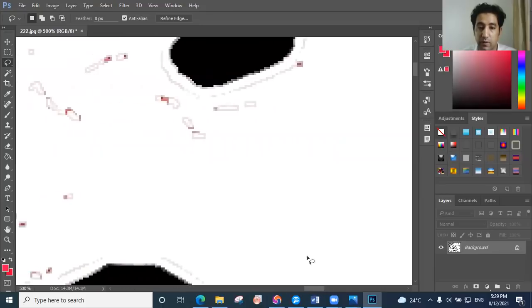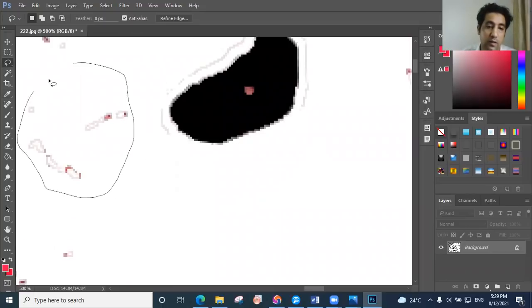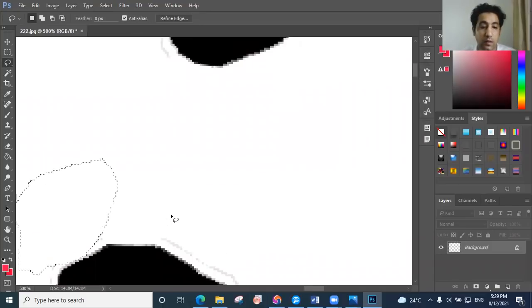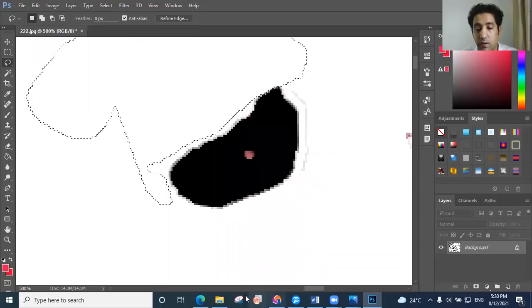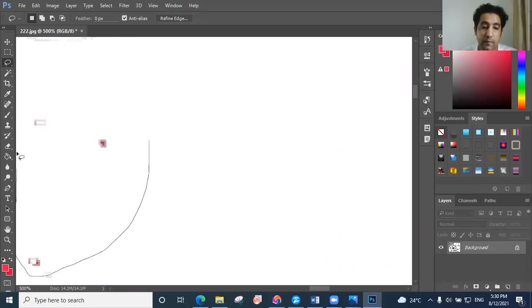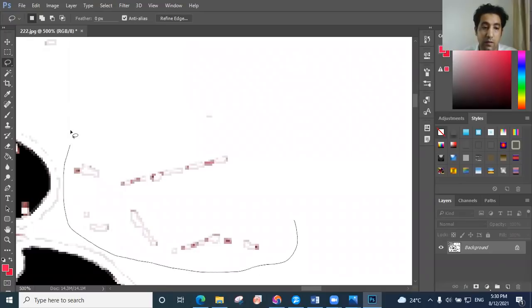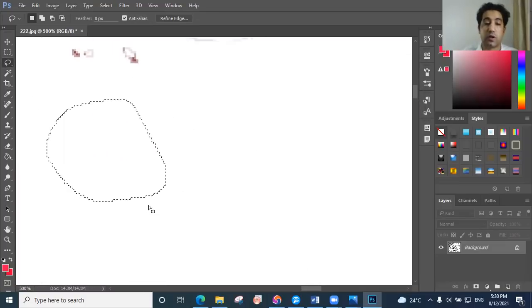It's okay, you can be wrong here. It will take long time, but good result.